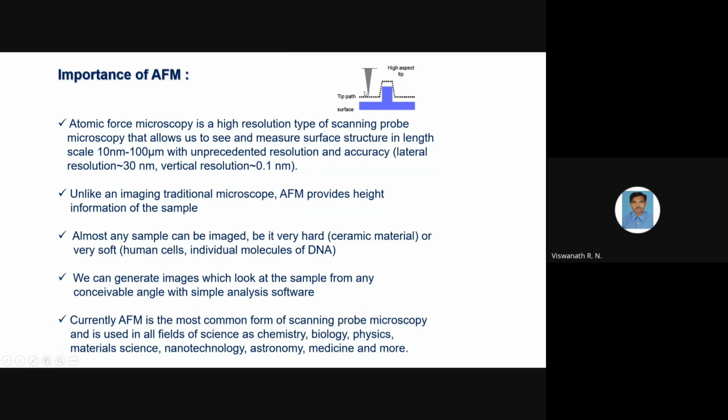So when it comes closer to this dome region, the tip or the instrument knows that some interference is there, so it will adjust the tip height. The assembly has a piece of material, so it will adjust the position in such a way that the tip maintains a constant force. It will always maintain the constant force. Wherever the force varies, it will change the structure.